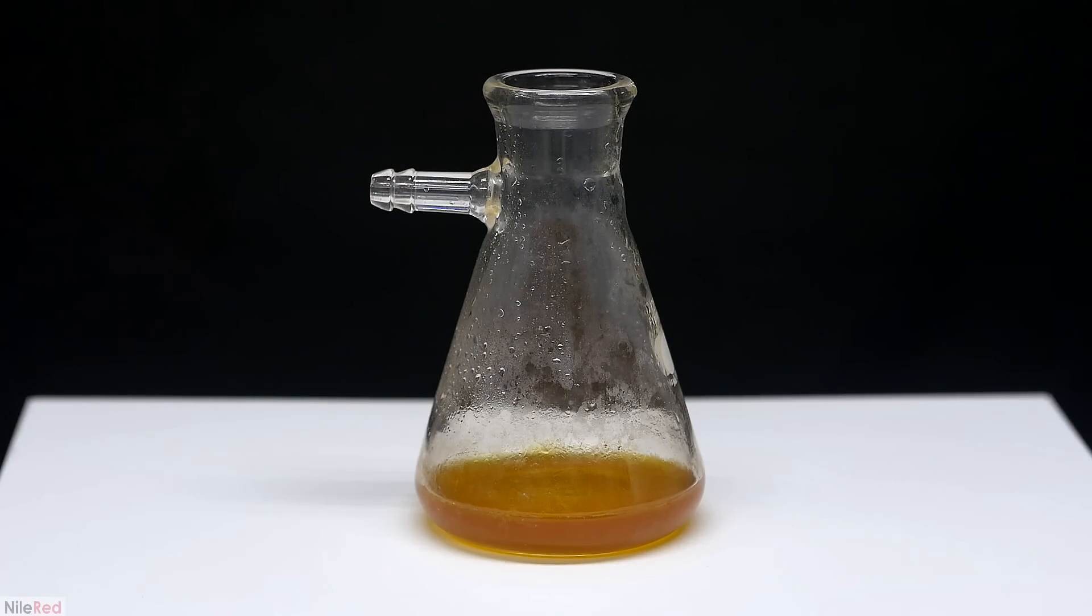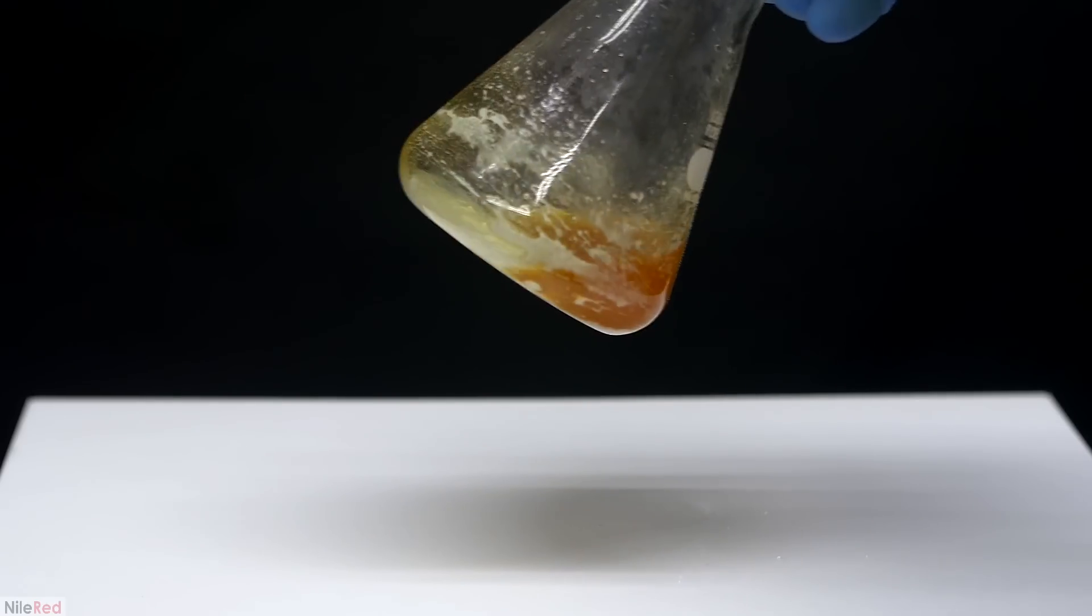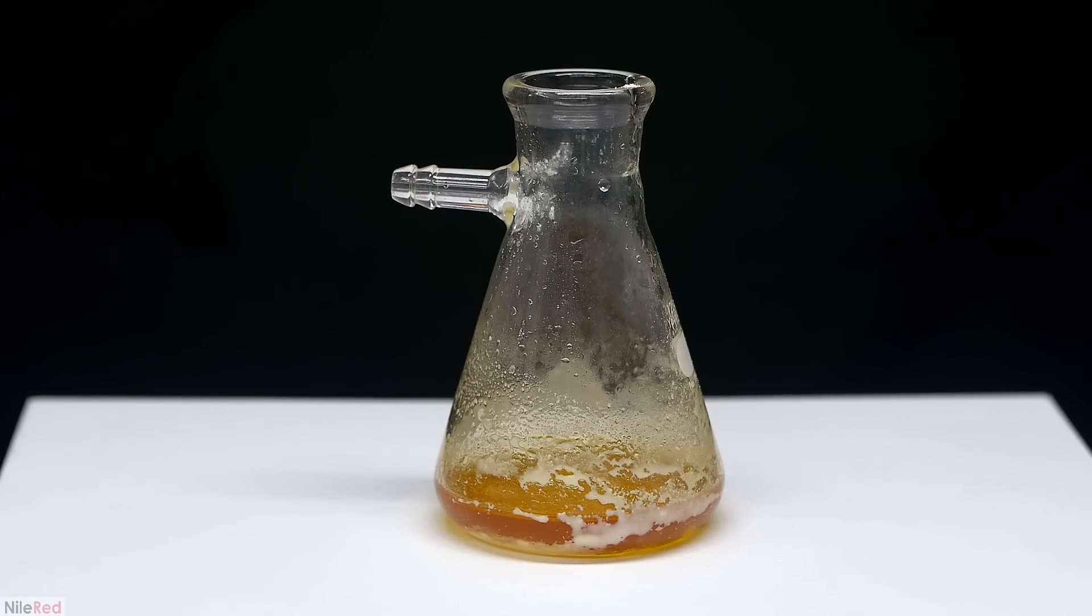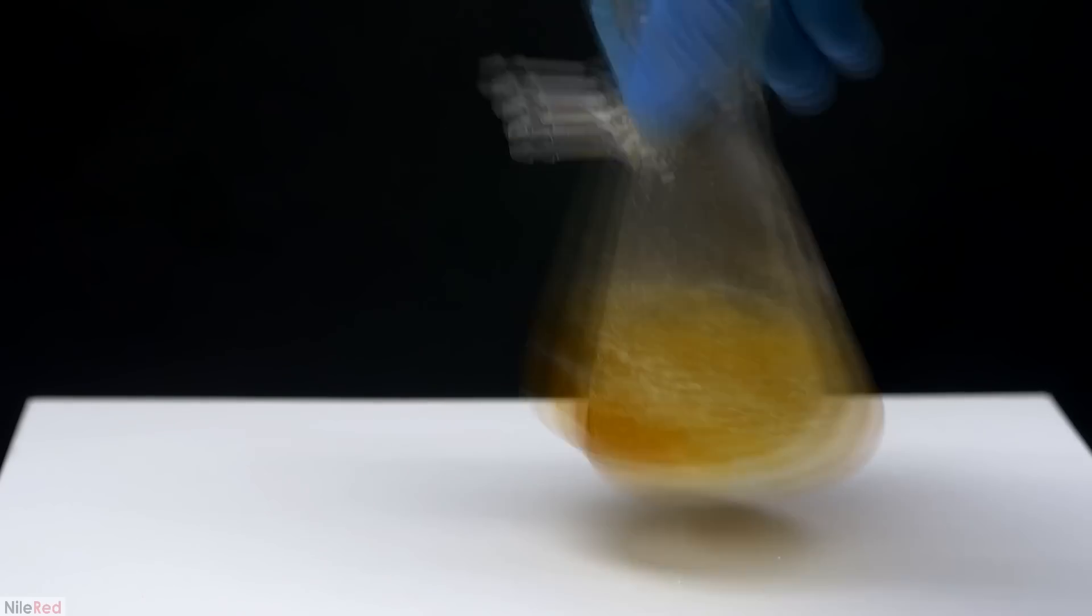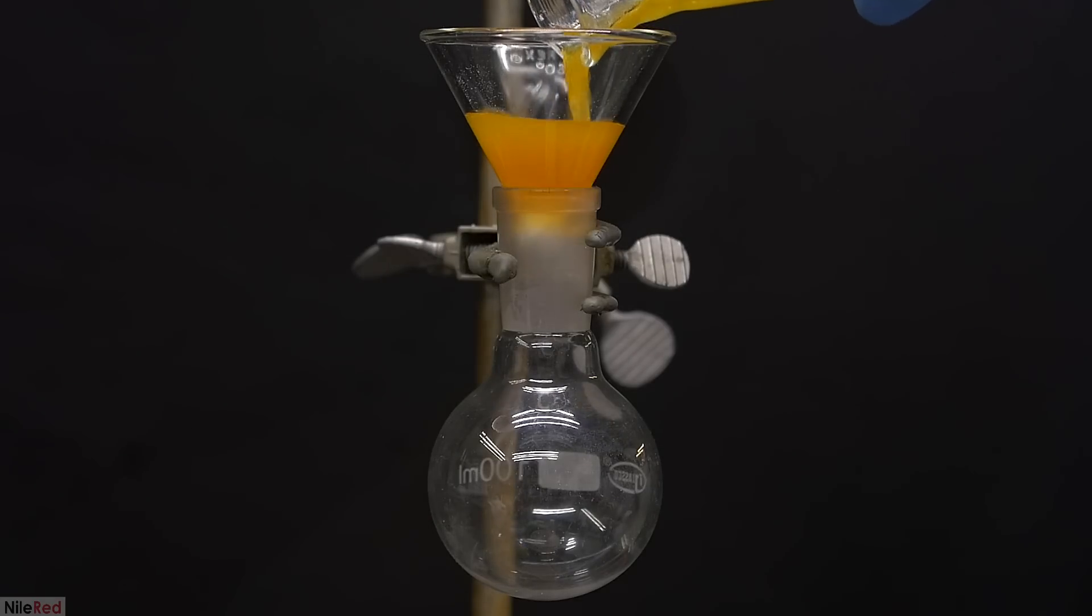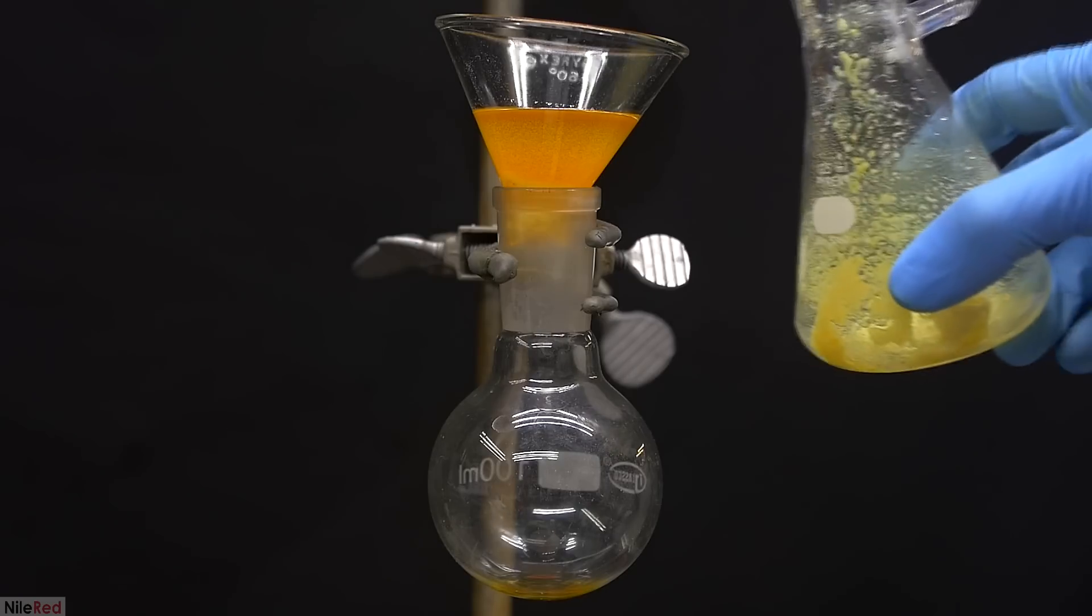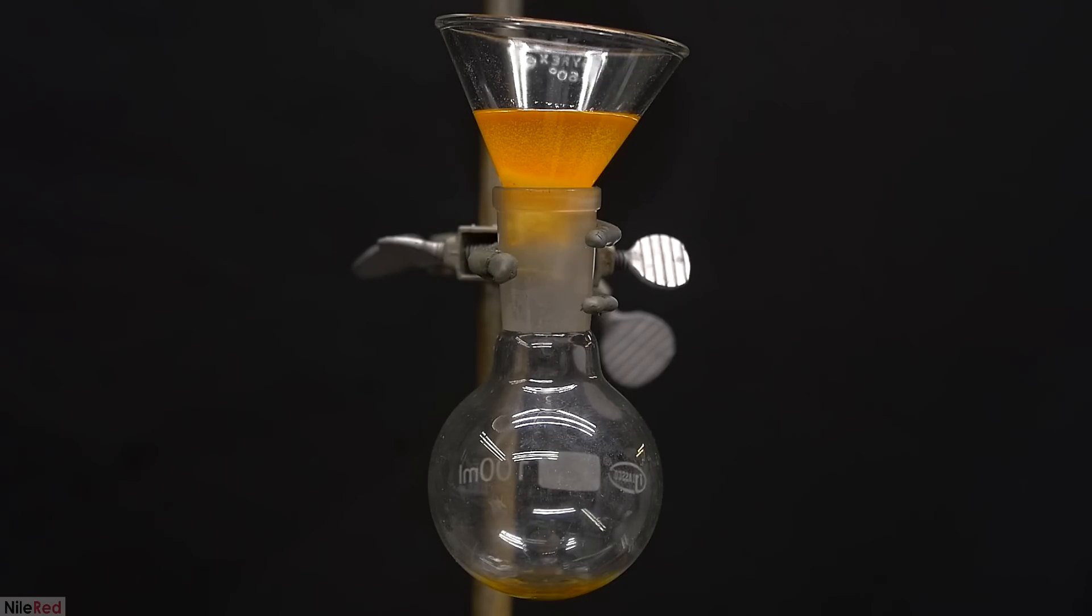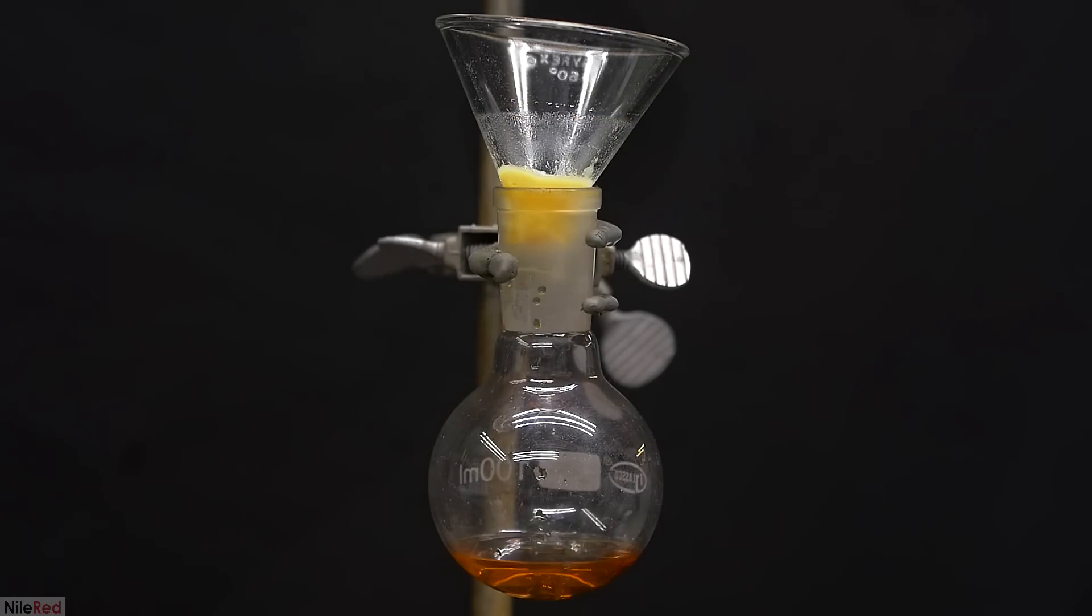Our oil here is a little bit cloudy due to the presence of water and we're going to have to dry things up. To do this, we add a little bit of dry magnesium sulfate, which will absorb and pull any water that might be present. The oil was then filtered through a little bit of cotton directly into a round bottom flask. The stuff that we filter through here is nice and clear, which indicates that most of the water has been removed.